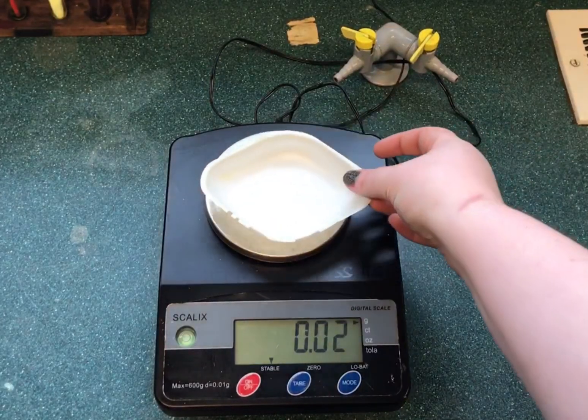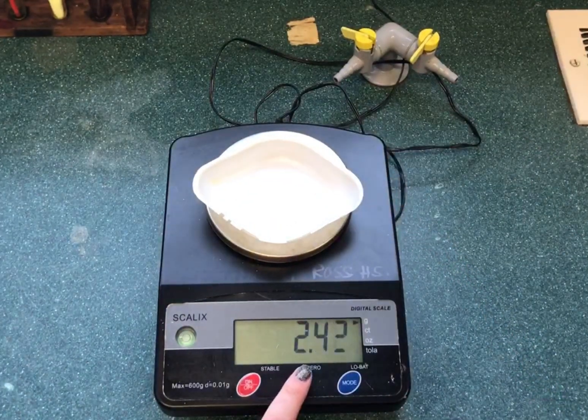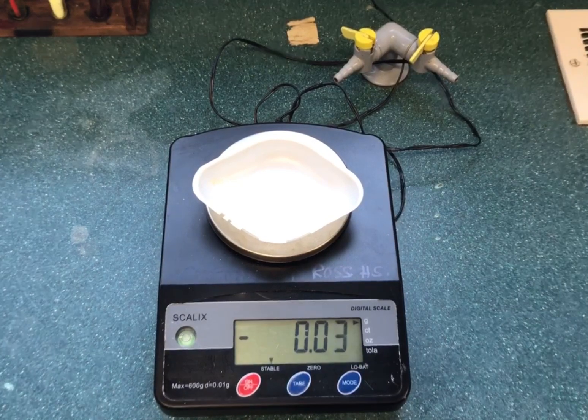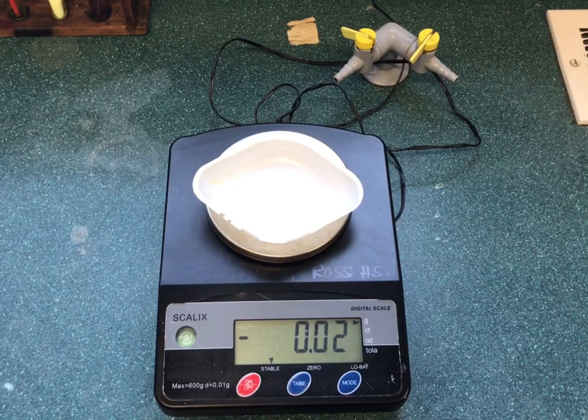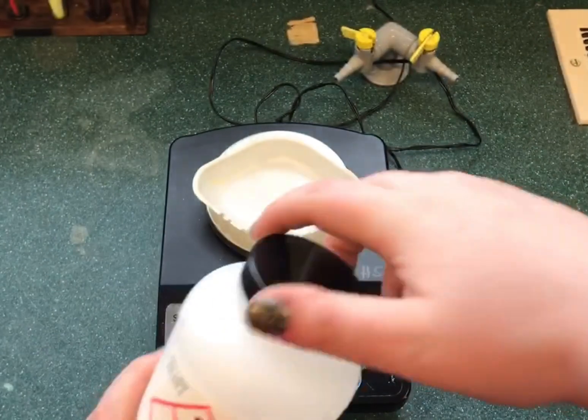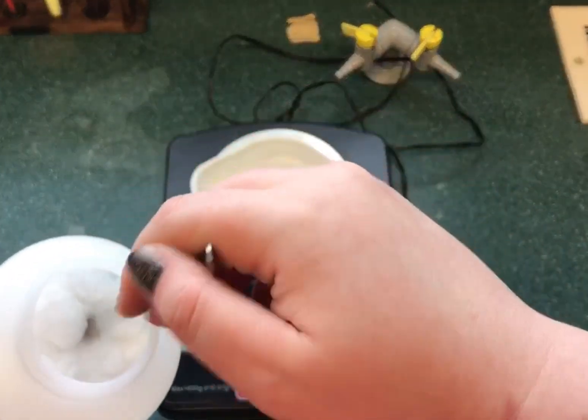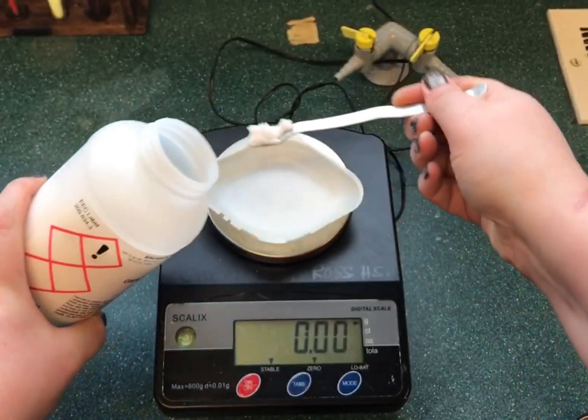There are different ways to use a balance. In this first clip we're going to look at the method of using the balance and using the tare button. When you do this, you put your weighing boat or the vessel that you want to weigh onto the balance and you press the zero or tare button. This then ignores the weight of the weighing boat or the beaker.